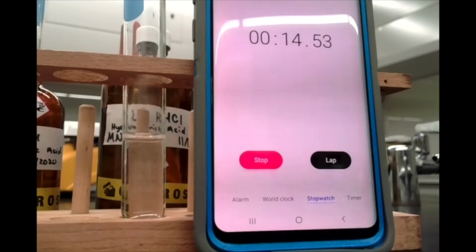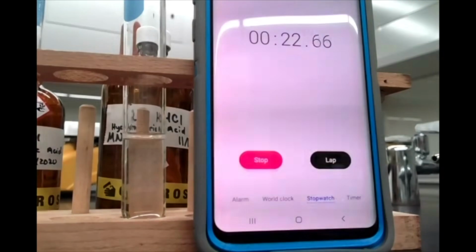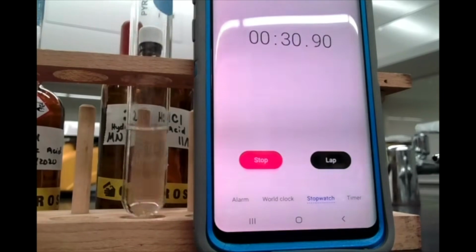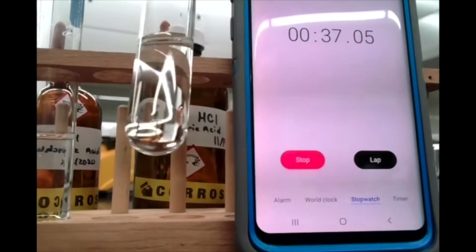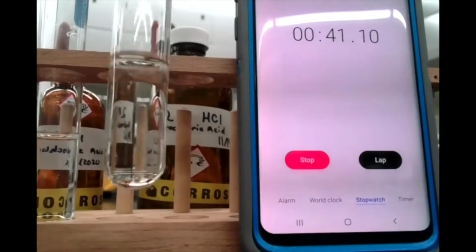Notice that the bubbling seems to be a little bit more vigorous here, right? So please note that rate and time are not the same thing. When the speed or rate of your reaction increases, the time it takes to finish should decrease. So be very wary of how you phrase your answer. You can see already that you might want to rewind this and see at what point the magnesium disappeared, but you can see it's already all gone.